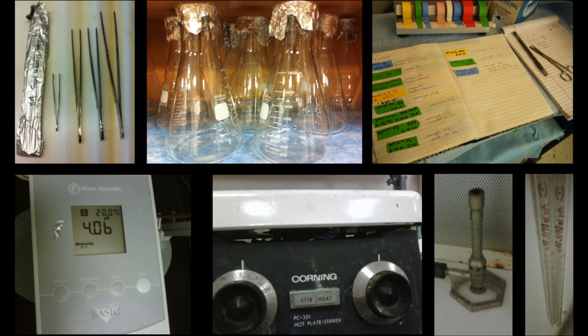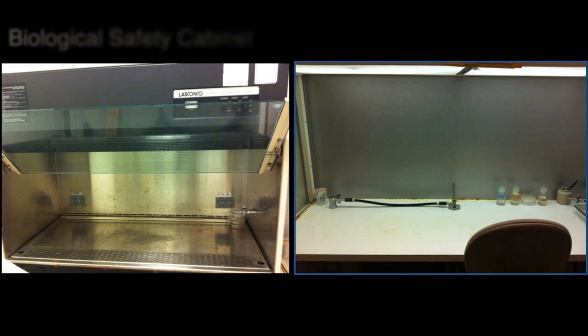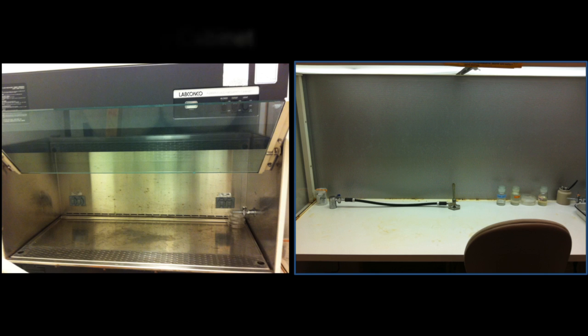A clean working area is very important for the establishment of clean cultures. Some examples of traditional laboratory working areas include the biological safety cabinet and the laminar flow cabinet. A clean working area should be protected from outdoor air currents, and working surfaces can be sterilized with alcohol or a bleach solution.